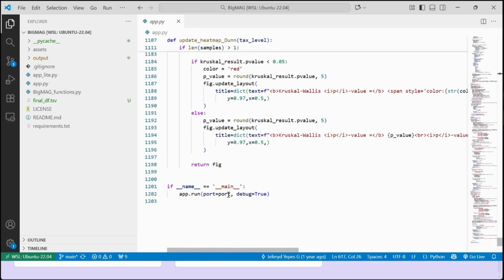And then at the end, here as well, you can control the problem that I was having with the notebook, the port. Sometimes if you don't specify the port in which you want it to render, for example you have another application running and you don't realize, then it is not going to run. So you can control that also. Here, this is coming, although I can provide it also with the command line.